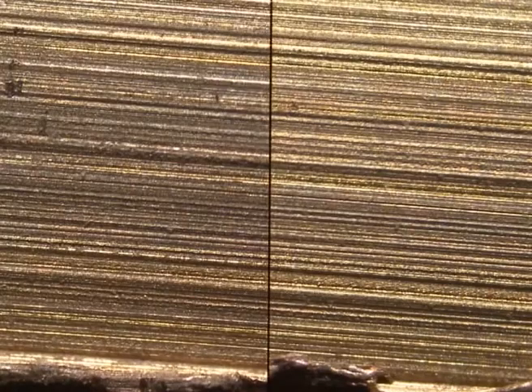It is extremely important that exactly the same type and make of ammunition be used, as minor variations in the hardness of components or pressure produced could seriously affect the appearance of the impressed stria. The bullets should then be cross-compared until a mental picture is obtained of what the salient features are and what marks can be disregarded.